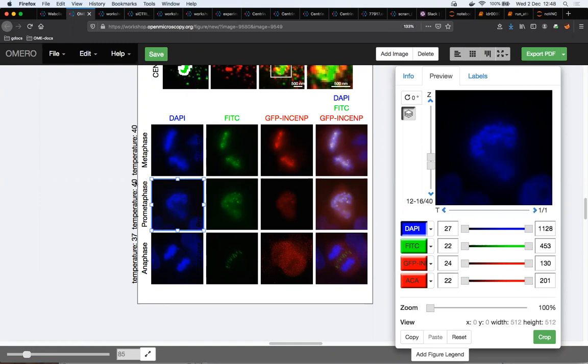You have to select first the correct plane, then export this plane, put it into Adobe Illustrator. By the way, nothing against those two softwares. Adobe Illustrator or the ZEN are great softwares, but the problem is once you disjoint the workflow chain between those two, as you do when you export stuff plane by plane and then put them into your figure, and then later find that you can't work with that particular Z plane, you have to go back to the ZEN software, export another Z plane, and this will lose you tons of time, and of course a lot of working effort.